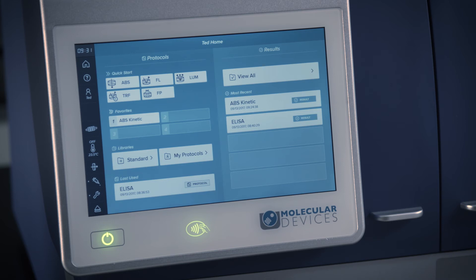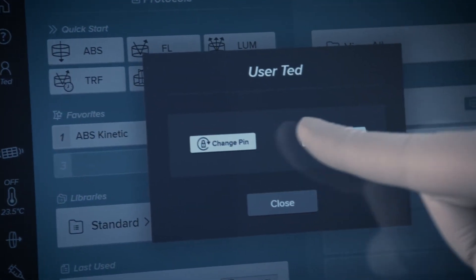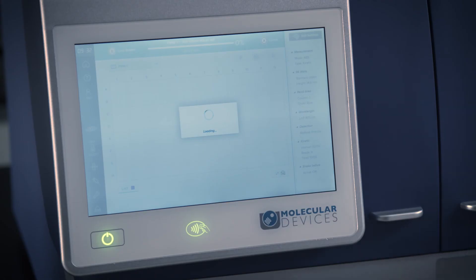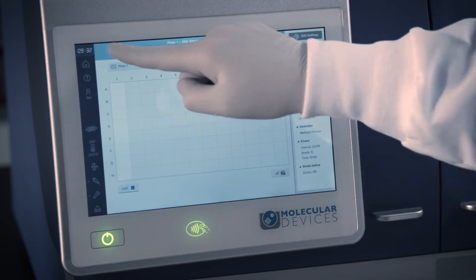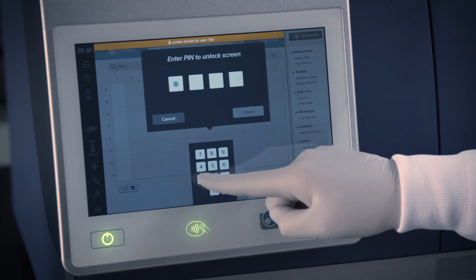When the reader is idle, users may log each other out of the reader by touching the user icon and then selecting Log Out. However, during a plate read, PIN protected users require entry of their PIN number to access the touch screen controls.